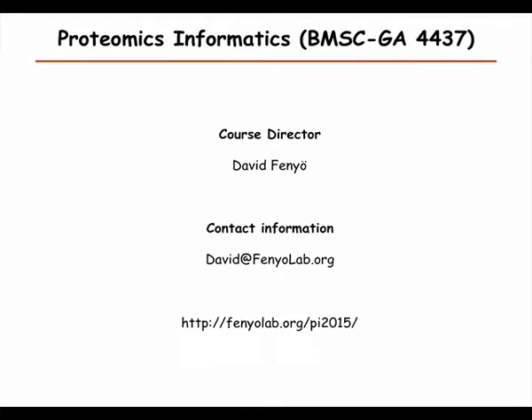Okay, so this course is on Proteomics Informatics, and we will have several parts to it. One is that we'll always have a small lecture, maybe an hour, maybe less, and then after that there will be more of a practical part that will involve programming, and we'll start from the beginning to teach you how to program in Python. And does anyone know how to program anything?